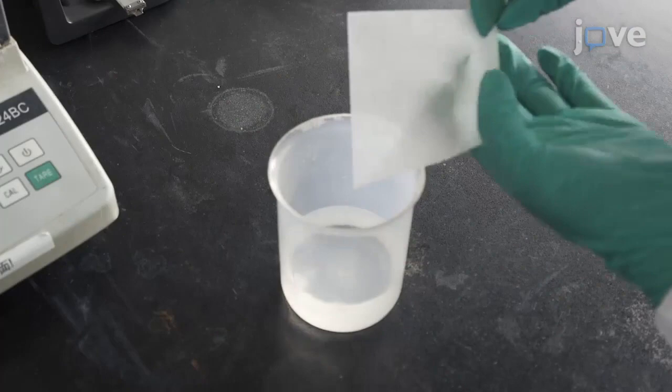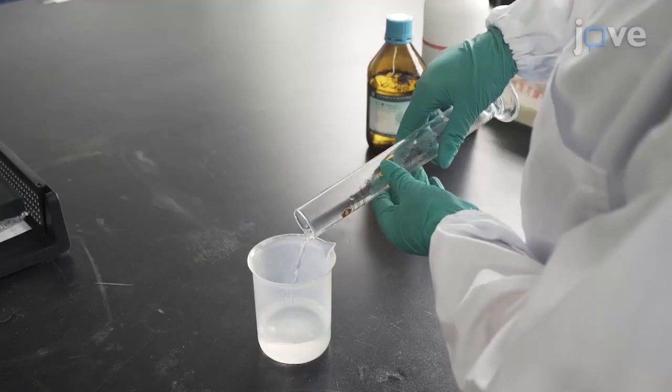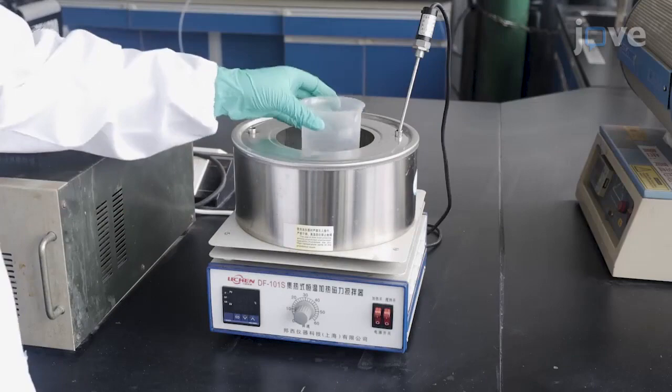To prepare the titanium dioxide by anodization, dissolve 0.3 grams of ammonium fluoride and 2 milliliters of water into 100 milliliters of glycol in a 200 milliliter beaker with a stirrer to form the electrolyte.